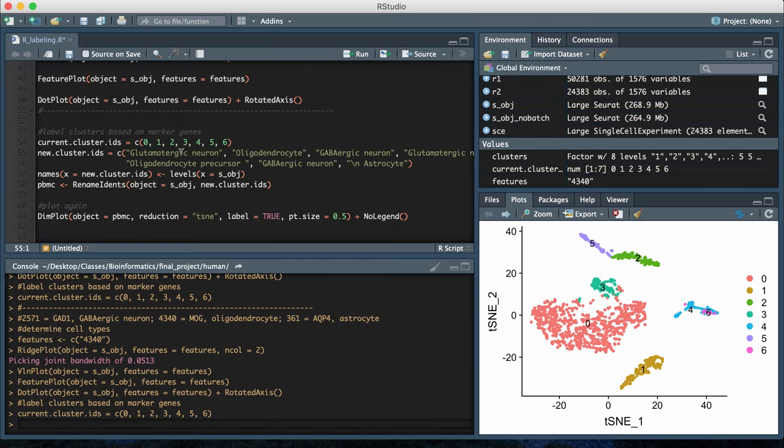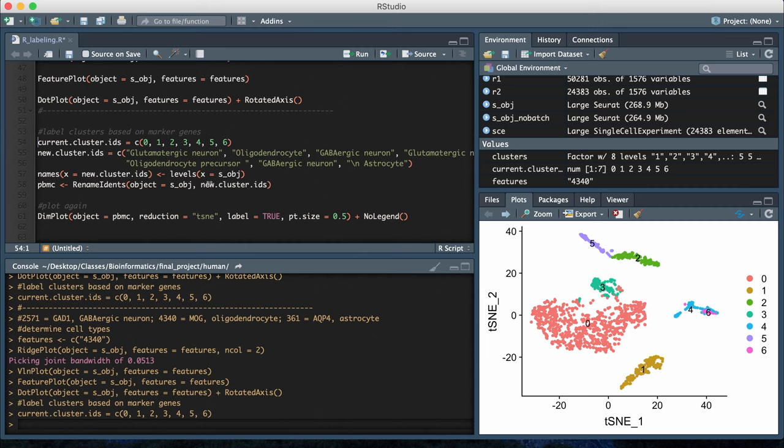The next and final part of my code shows how you can actually change the cluster labeling into the different cell type IDs and add that to the t-SNE plot and your Seurat object.